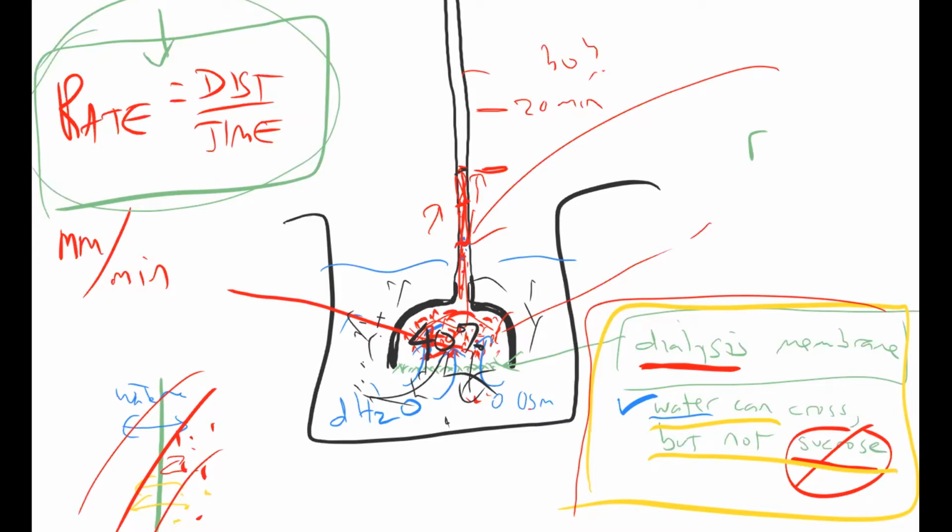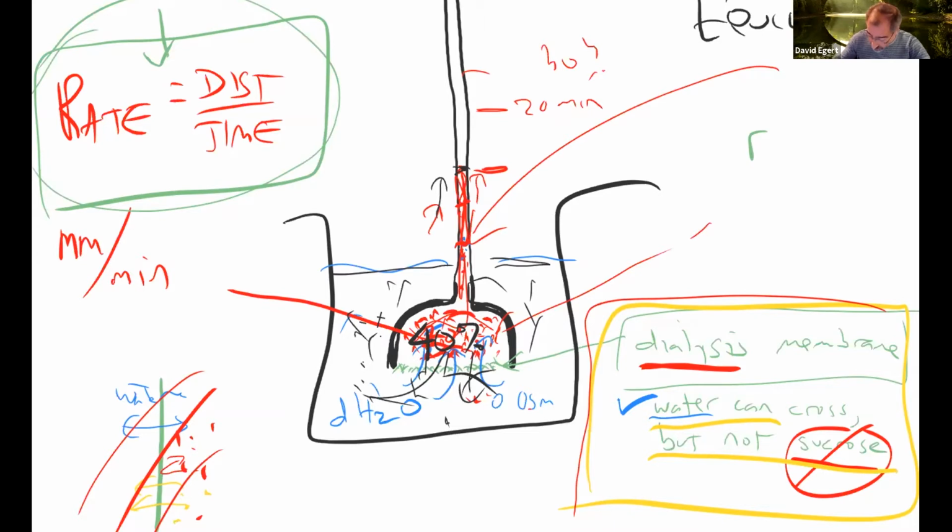No, but what I want you to be thinking about here is, if the water is up the tube, especially if we let it sit and hit some equilibrium, we walk away and come back and it settles in, and the water is still up the tube compared to the level in the beaker, I know that there's got to be some pressure pushing the water up the tube.